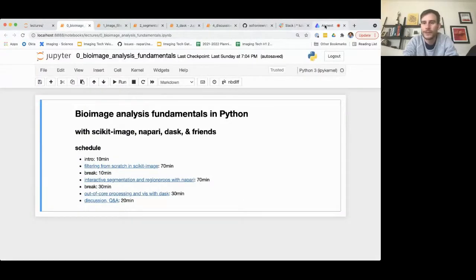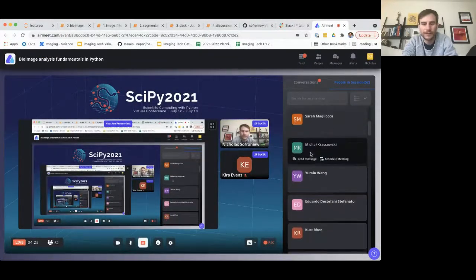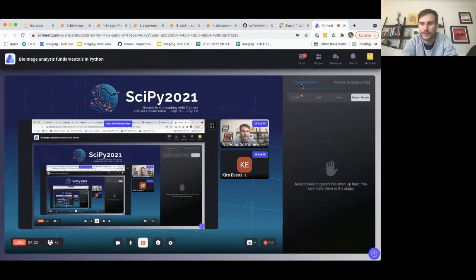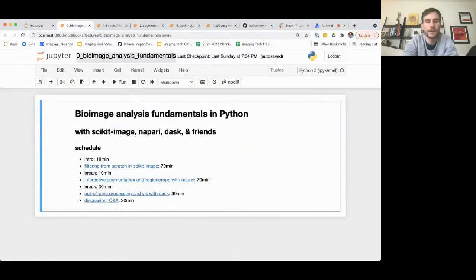Kira, is there anything folks are running into in the chat? It's hard for me to monitor the chat at the same time, but I'm not getting any red flags. So maybe we'll dive right into the first lesson. But really, folks, please ping if you're having a tough time getting going. And as I said, it's really my pleasure to be teaching today about bioimage analysis fundamentals in Python with scikit-image, Napari, Dask, and friends.